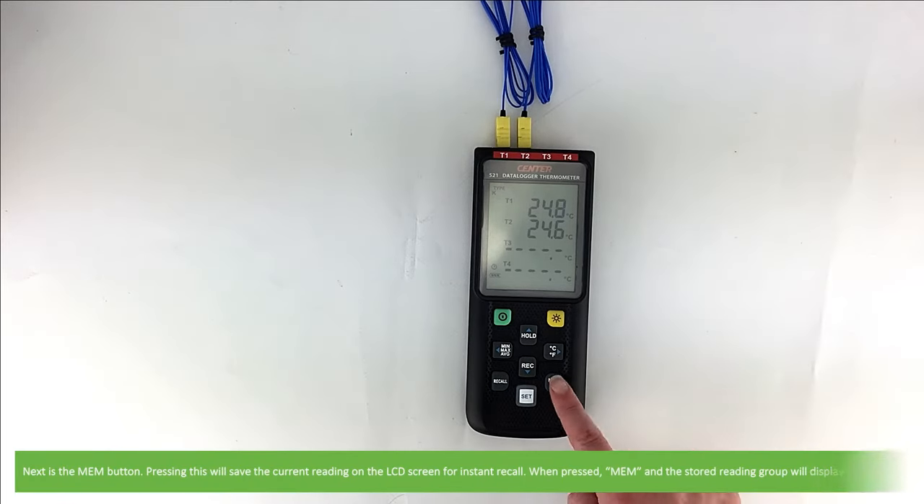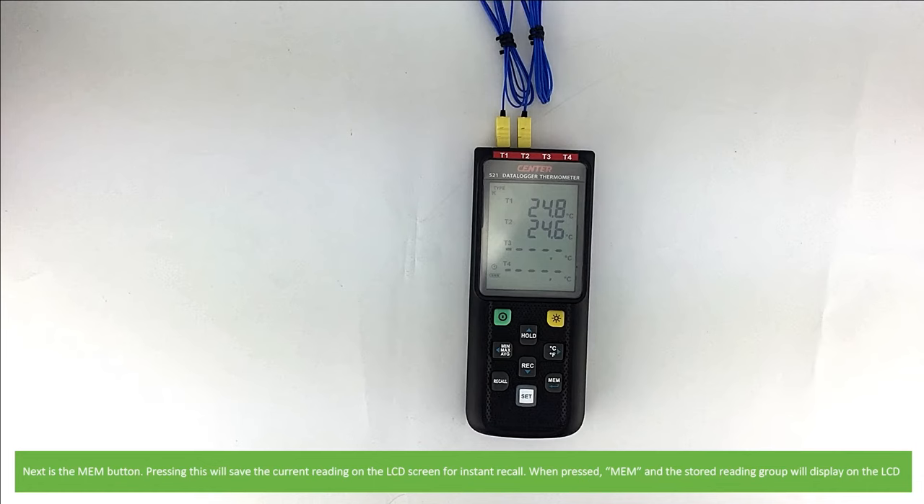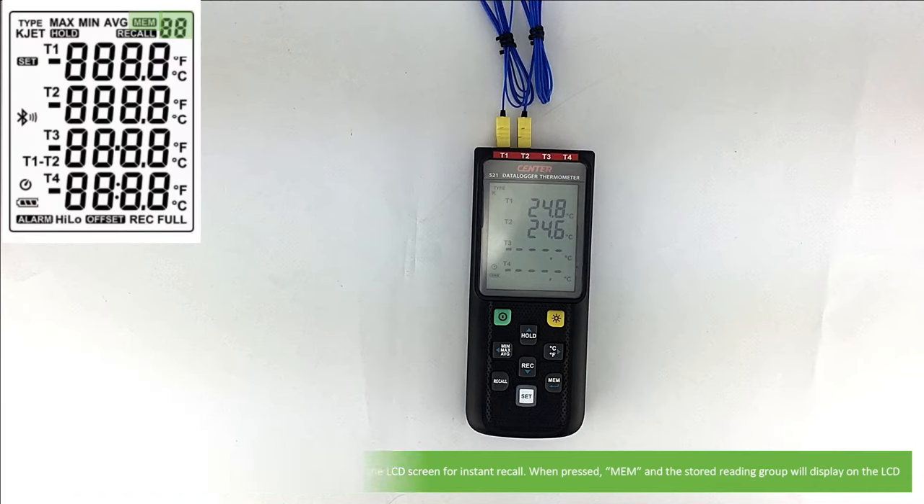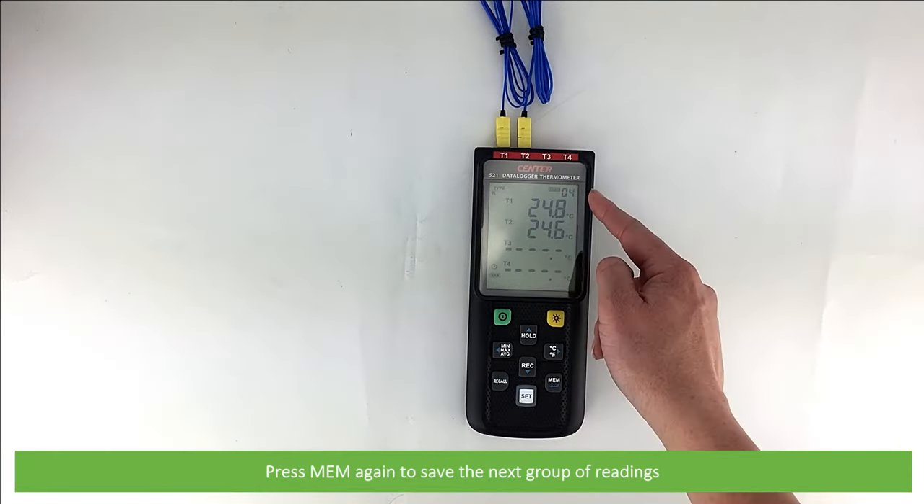Next is the memory button. Pressing this will save the current reading on the LCD screen for instant recall. When pressed, MEM and the stored reading group will display on the LCD. Press MEM again to save the next group of readings.